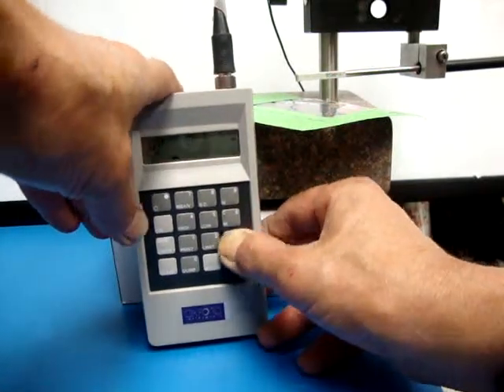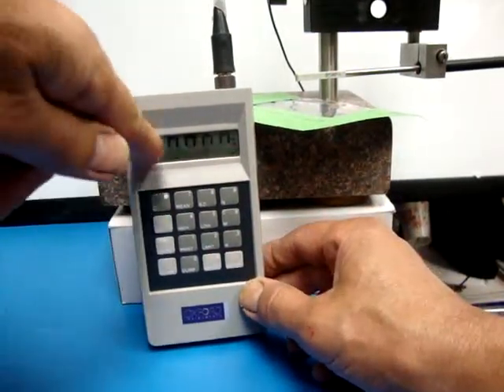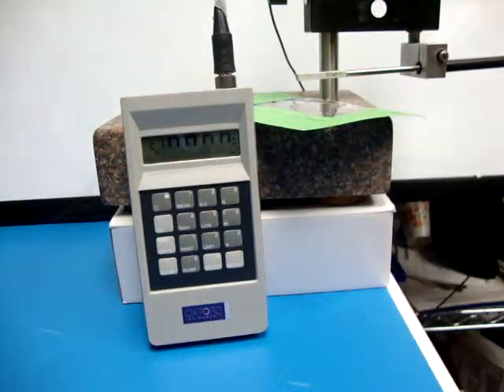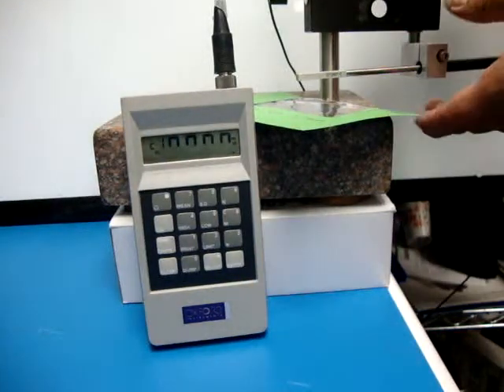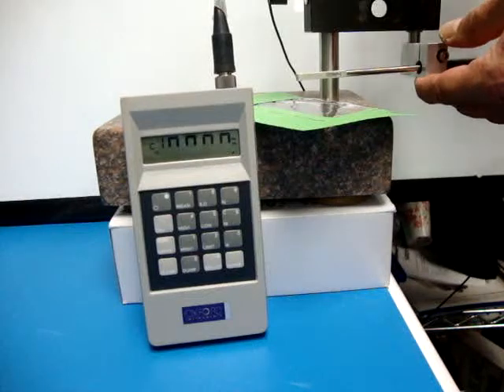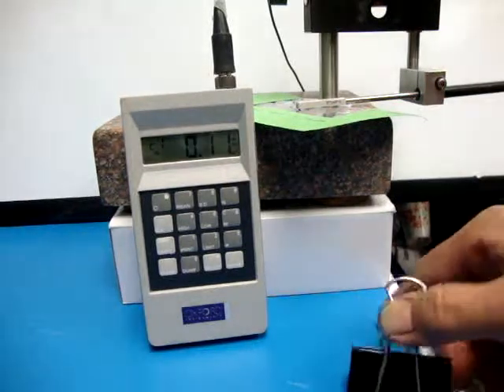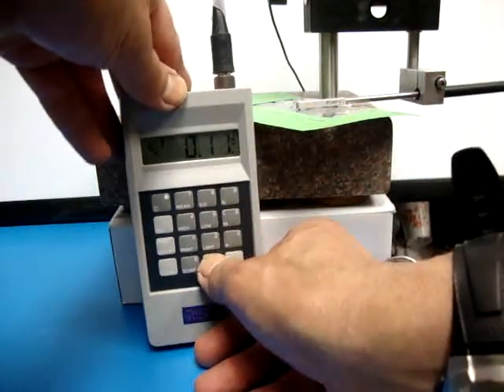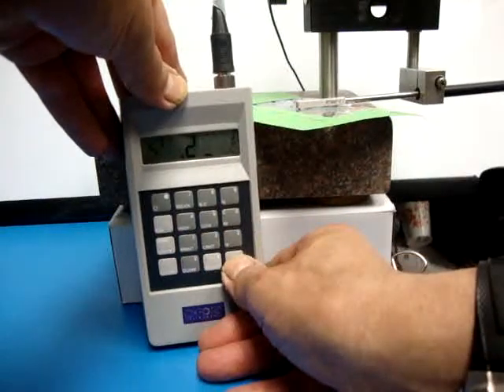So now we hit star CAL. And now it's looking for the first calibration shim, C1. So I'll place it down on the base, and I'll enter the value of the shim, which is 0.2. Enter.